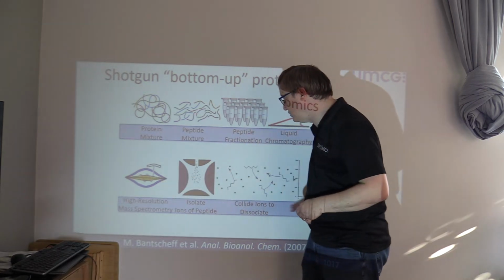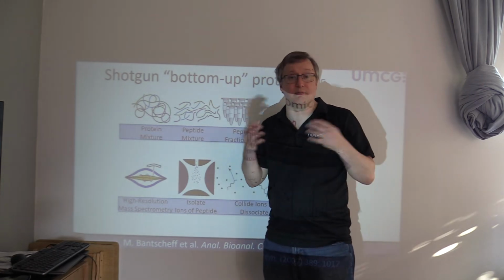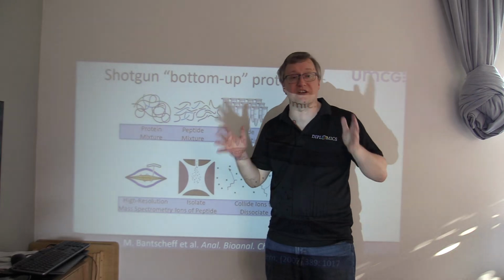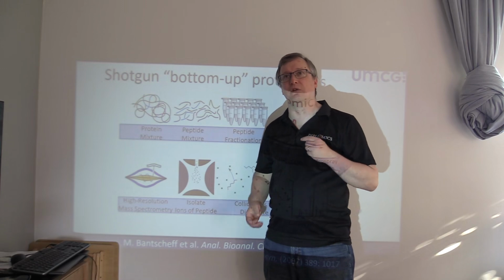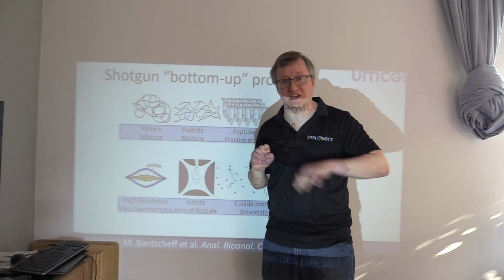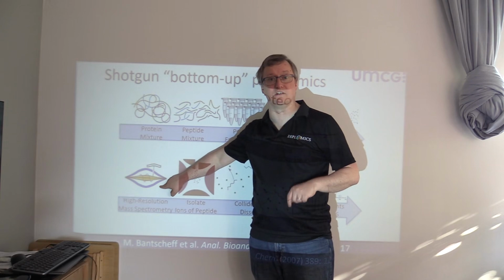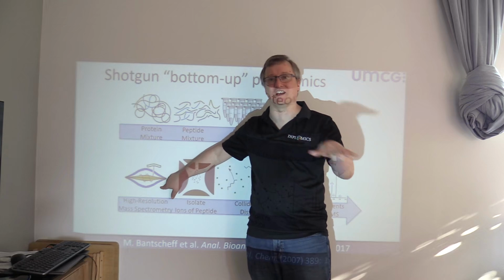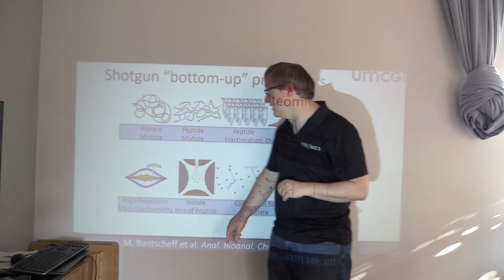And down here we have two different kinds of measurements that are taking place. We typically have a high-resolution mass spectrum that says essentially which mass-to-charge values have intense signals right now, which is another way of saying which peptides are most concentrated in the set of peptides coming off the column right now. So this is going to give us a highly mass-accurate representation of what their masses are, because we can infer charge by things like isotope spacing. And that gives us a lot of information when we try to identify those peptides later.